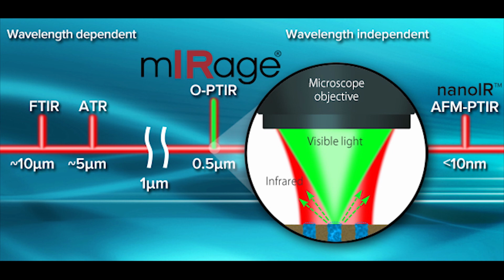There's a question, Kurt, about whether it is possible to apply this technique to a particle, say a few tens of microns in diameter. Yes. A lot of times you can simply take your particle and put it on a piece of double sticky back tape, focus on the top part of the particle, and get a spectrum of it without getting the spectrum of the tape. That would be one way to do a sample like that. Pretty easy sample prep, and you get a nice spectrum of a 10 micron particle.